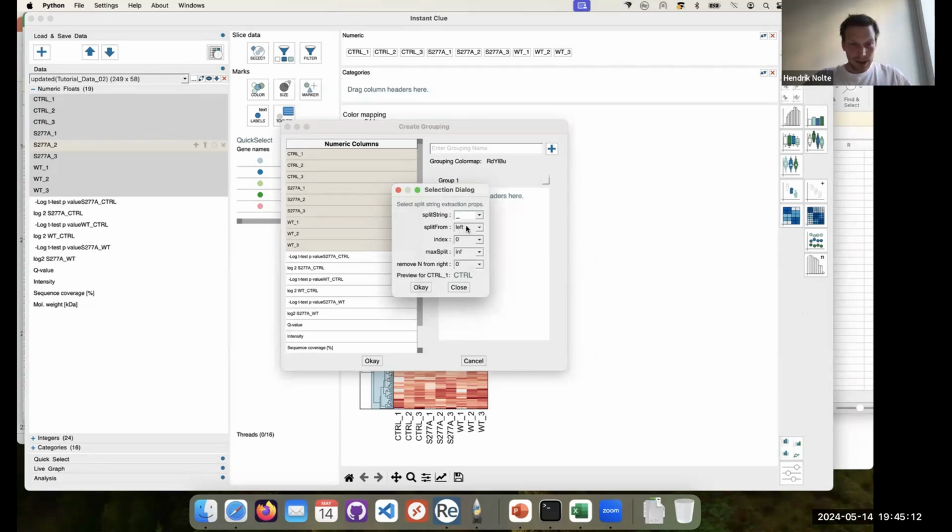So in this case, we're starting on the left. We take the index 0, so it's starting with 0 indexing. And the number of splits that it can perform is infinity, so it splits everything. There is a detailed introduction in the GitHub pages actually on how this works.